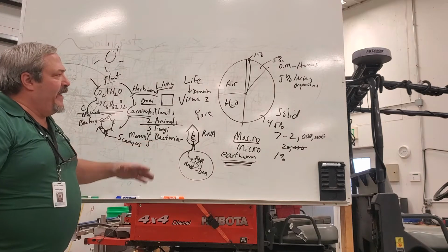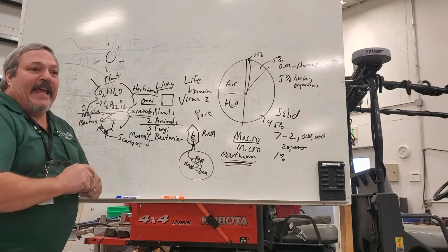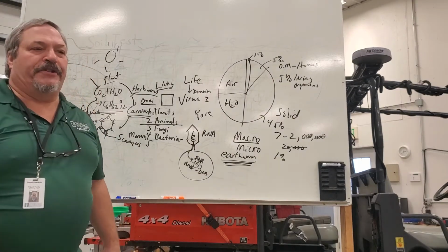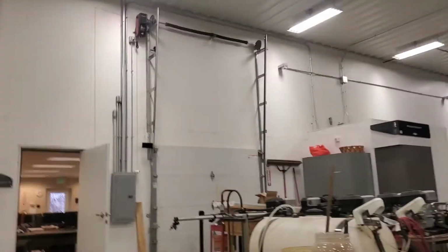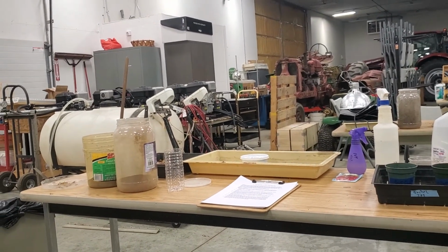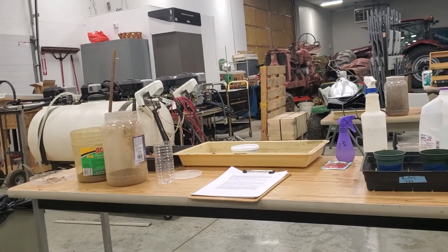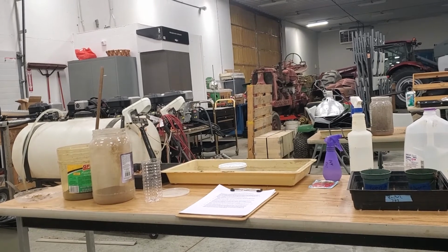So I'm going to take a little bit here, spin around, and turn the camera the other way, and we're going to try to conduct a couple of different experiments, and I'll talk about what you have to keep track of. So let me spin the camera around here, get this situated so it's pointing at where I'm going to be standing. Sorry, my camera's not cooperating. I want to get it level with the table. So that's probably going to work there.